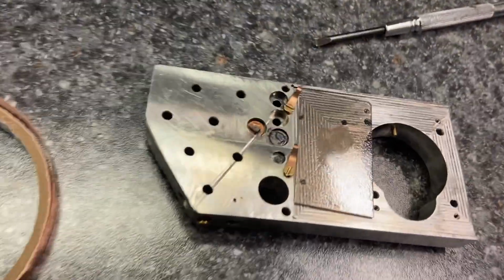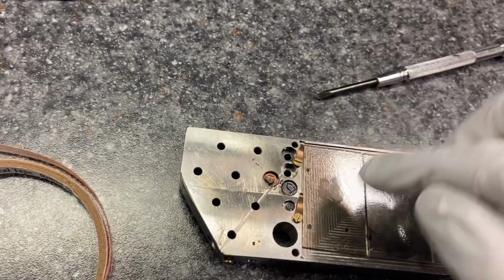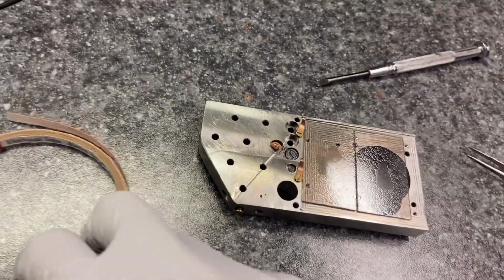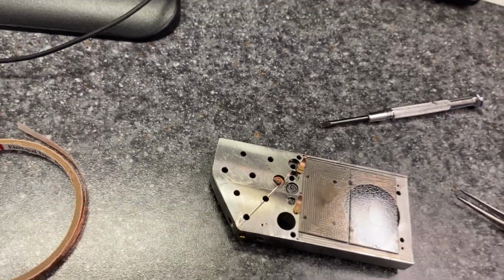So anyway, basically I just put the two thin sections of interest here, and then I keep them in place with these pins right there. And then what I'm going to do is I'm going to put this copper tape on top and on the bottom. Again, this provides two things. The first is to prevent charging.